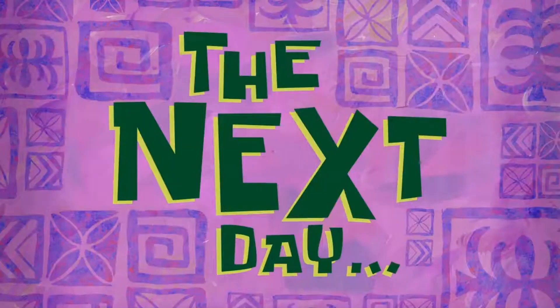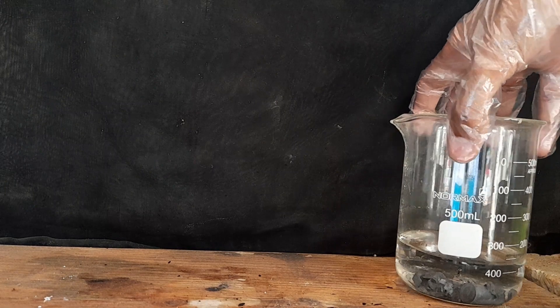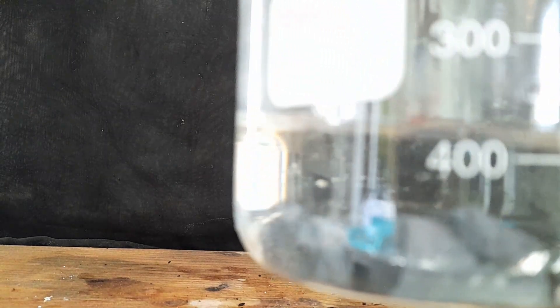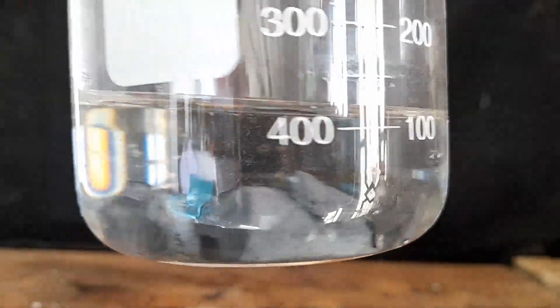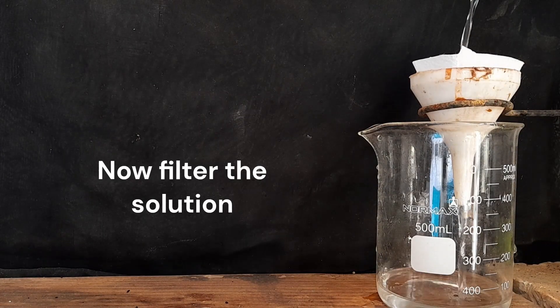The next day, filter the solution to get rid of unreacted zinc.